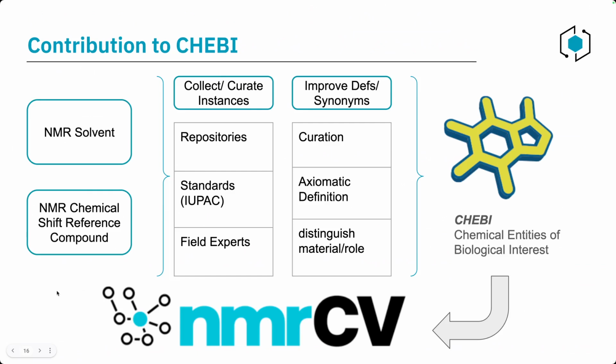And also we have curated them and tried to align the axiomatic definitions with the textual ones, and distinguishing between the materials and their roles. And we have submitted this work to ChEBI, and after it was approved there, we have re-imported it to nmrCV.